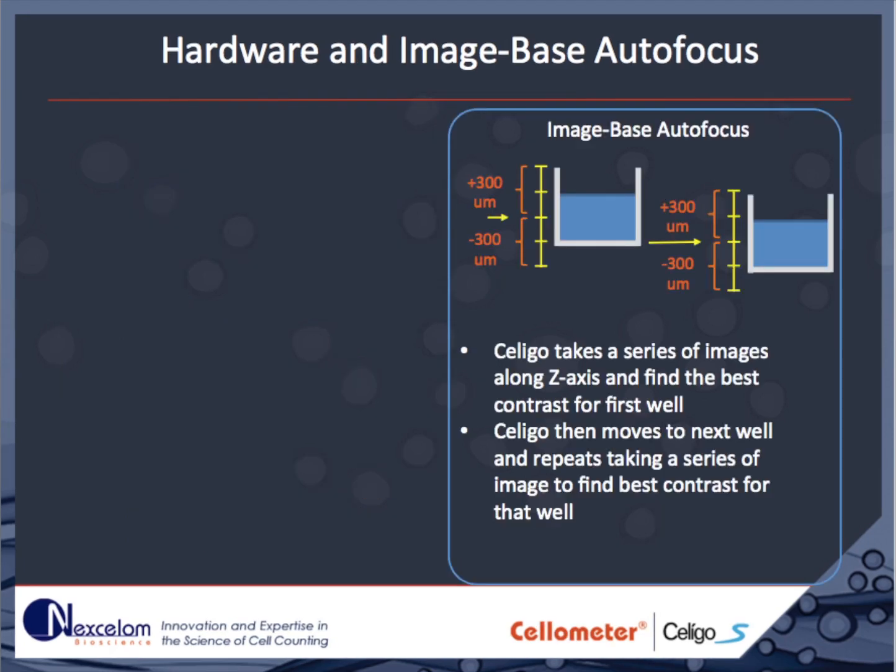Image-based autofocus can be used in lower-quality plates that have inconsistent plastic thickness. It works just like a digital camera where multiple pictures are acquired at different focal depths or Z positions. The Soligo then analyzes the image for best contrast and automatically chooses the best position in each well to provide a focused image.